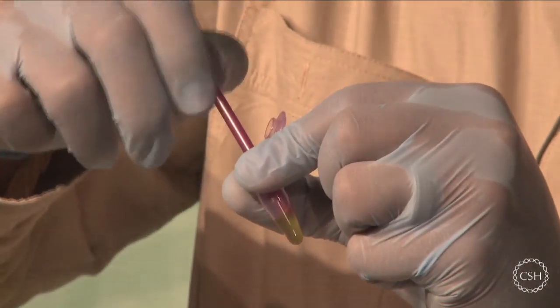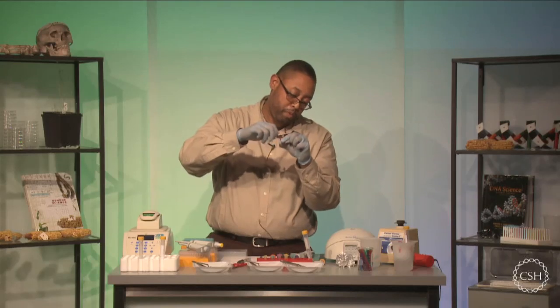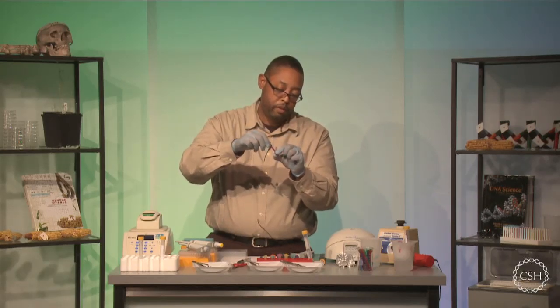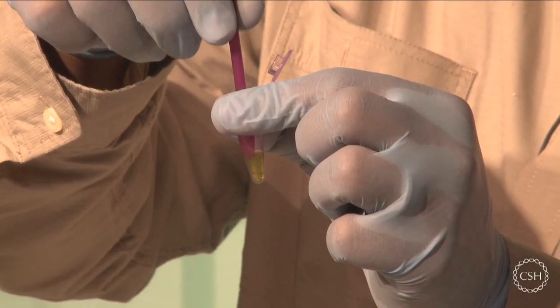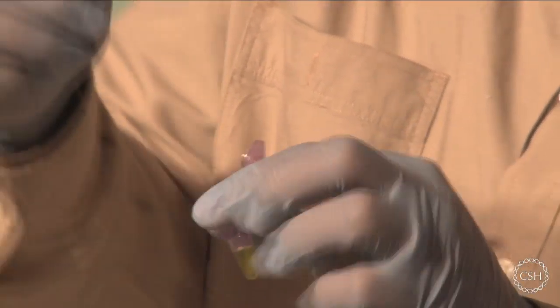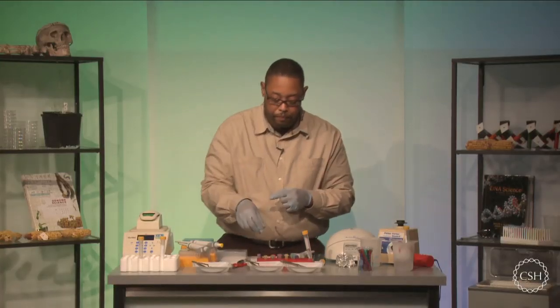Okay. Make sure the tissue is pretty well ground up and that the tissue is pretty unrecognizable at the end of this. Okay. I will reiterate to forcefully grind while you're in here. Don't give a small amount of grinding up and down. Make sure you're pressing down and twisting very hard. Okay. That's sample number one. I'm going to close that up. And I'm done with this pestle, so I'm just going to push it to the side.